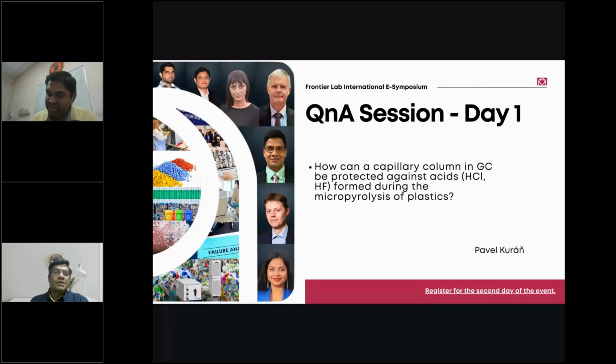Maybe first I would just like to ask some questions to Dr. Karthik, specifically related to your presentation, where I think you were comparing the degradation profiles of the polymers using the micro UV analyzer coupled with GC mass spec and also the weather meter. In some of your slides, slide 24 or 25, you show that the UV radiation flux, or the intensity, seemed to be more for the micro UV system. So is that due to that higher power that you are finding a faster decomposition in a shorter period of time, whereas the weather meter seems to have a lower power?